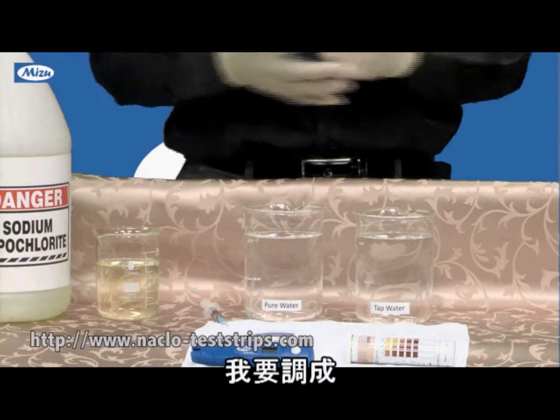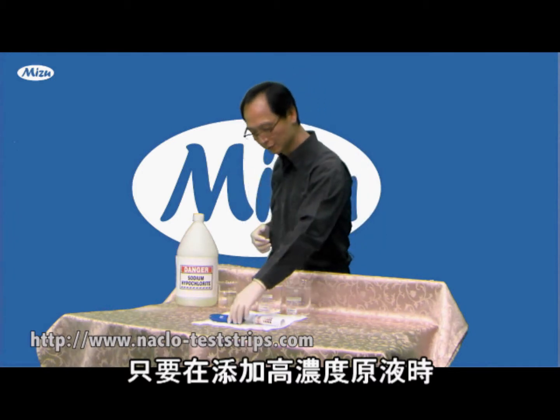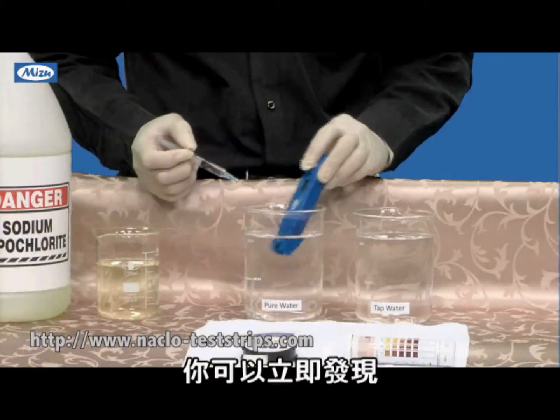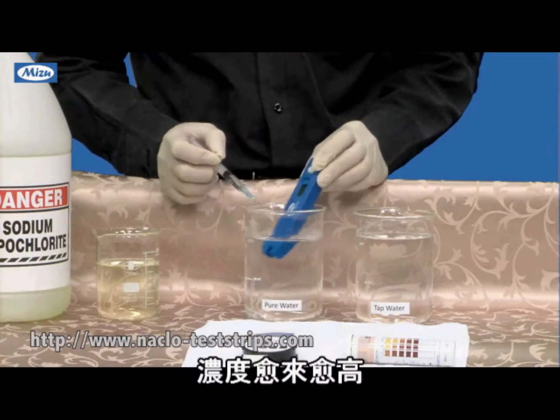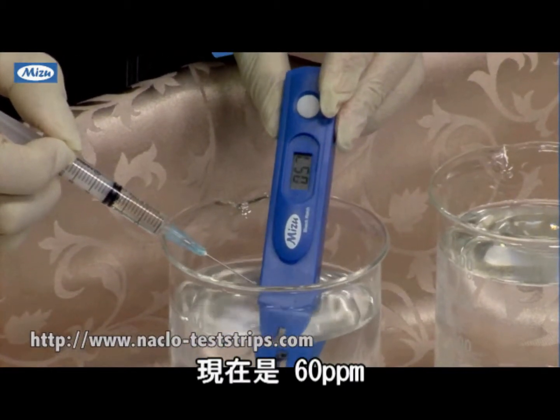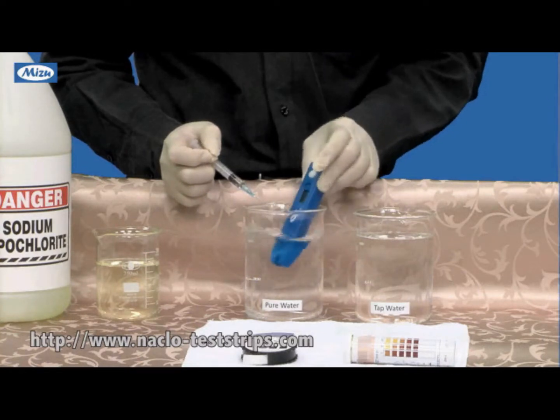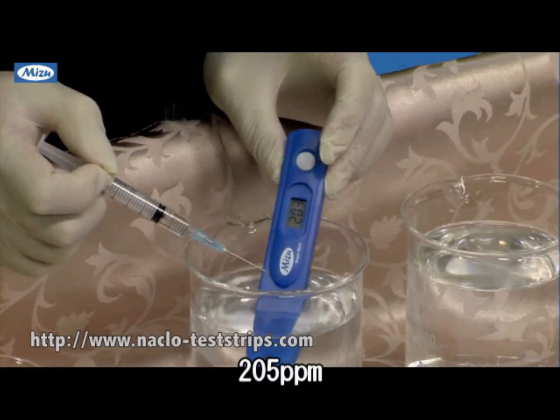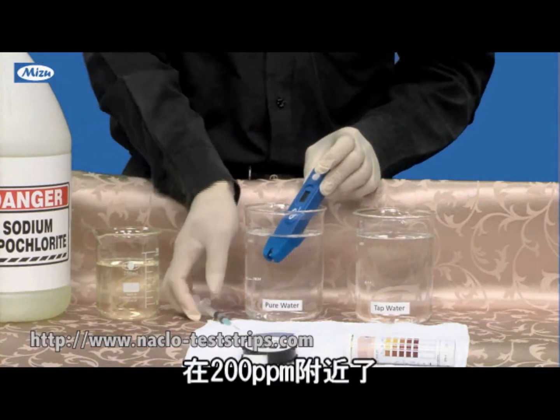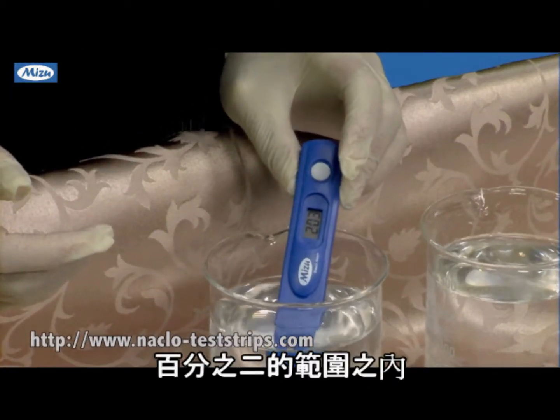If you want to prepare a solution for 200 ppm, use this pen and add the sodium hypochlorite gradually. You will see the concentration becoming higher and higher — it's 60 now, 185, 205. That's the number I want. I want to prepare a solution for 200 ppm, around plus or minus 2%. Now it's 203.